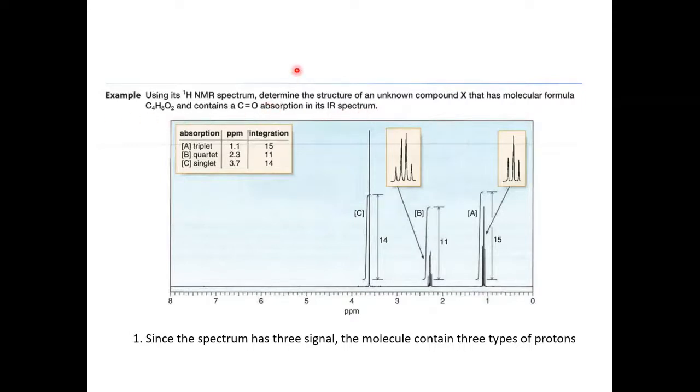So there is no amine, nitro compound and other things. Thio compounds and some nitrogen compounds like amines, nitro, azo are all ruled out by using the molecular formula, right?